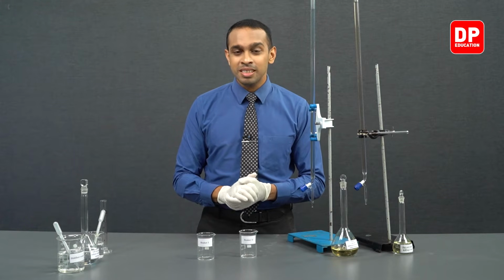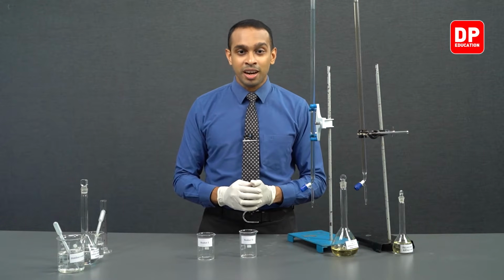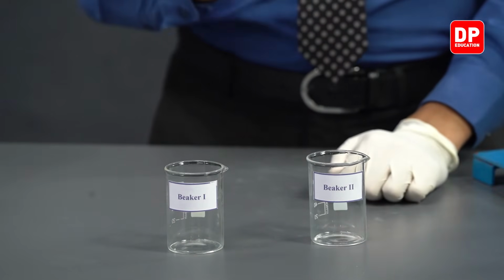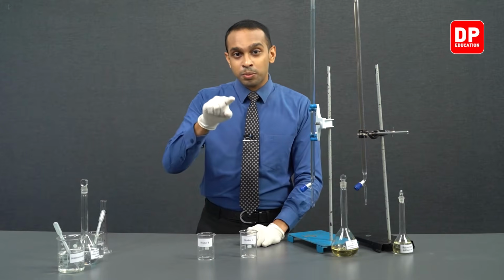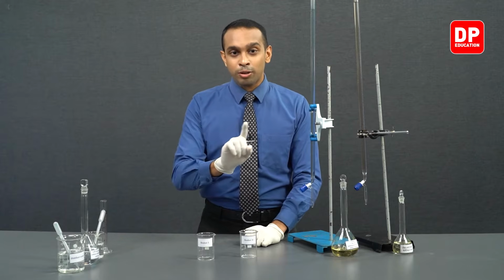However, students, iodine won't get a chance to produce a blue-black color with starch, because in this medium, a specific amount of sodium thiosulfate is also there. So iodine that is produced will first react with the sodium thiosulfate that is in the medium.